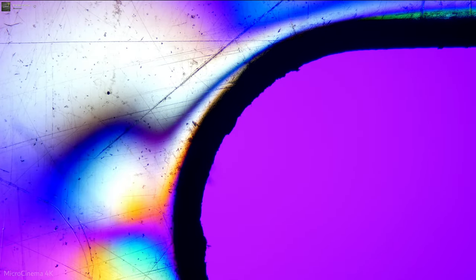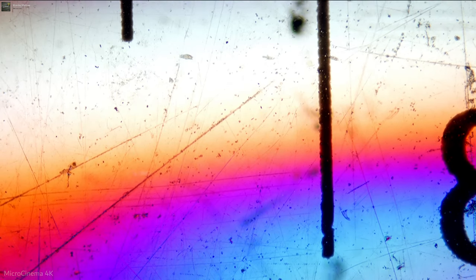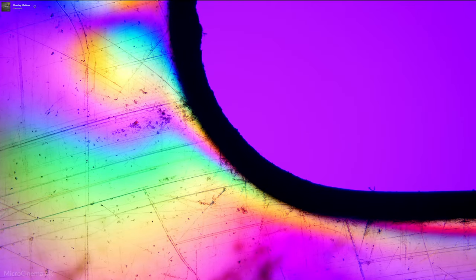And then the quarter wave plate is a wave plate that allows you to convert linearly polarized light into elliptical or circular polarized light. That's a way of saying that we convert it to light which doesn't have a linear polarization anymore, so you can no longer perfectly extinguish it with another polarizer. That has some interesting applications as well. And then there's the half-wave plate, which is basically just a polarization rotator.